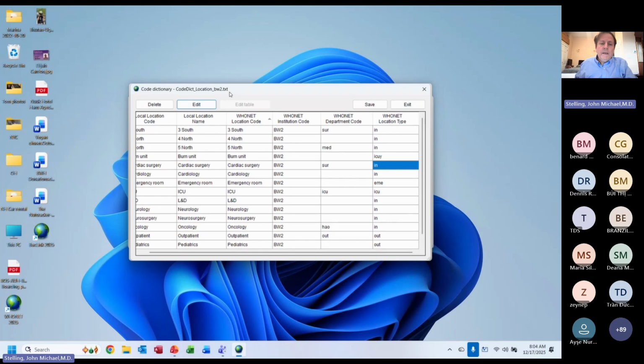The other reason I would use Excel a lot of times is if people do free text, they'll type Staphylococcus aureus 5 different ways or 10 different ways. S. aureus, Staphylococcus aureus, with a space, with a period, Staph aureus, but they misspelled aureus. So sometimes it's just a pain in the neck. They have so many different ways to spell things. It's just sometimes easier to do the mapping in Excel. Or I already showed you in BacLink, you can do many at the same time. If I search for aureus, I can define all the different aureus at the same time.